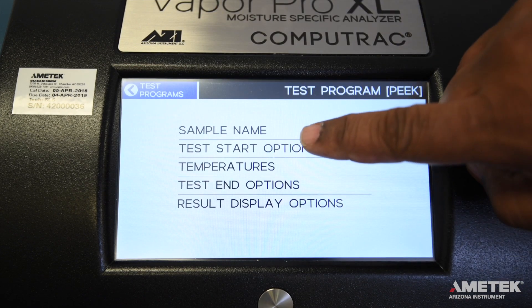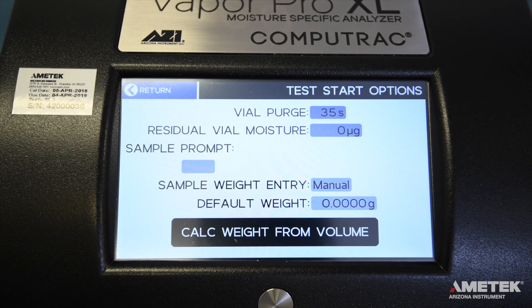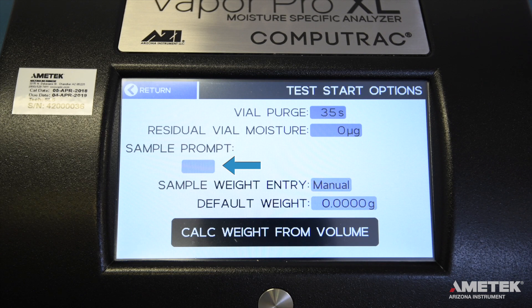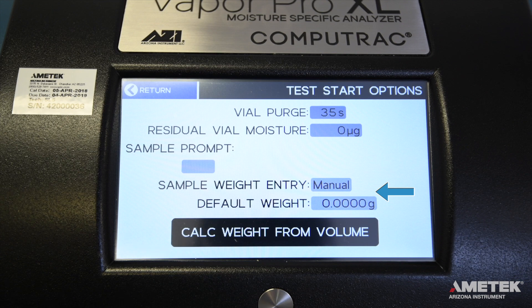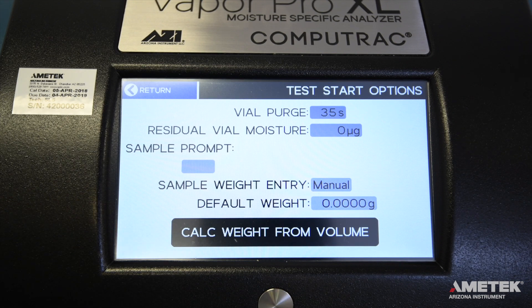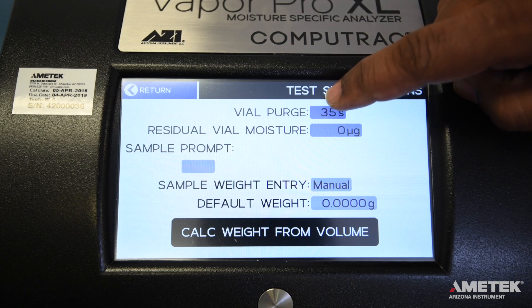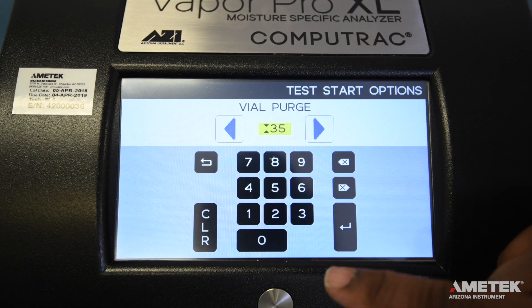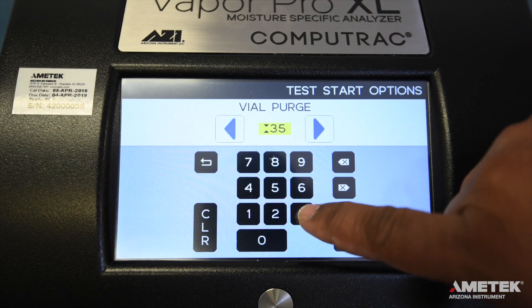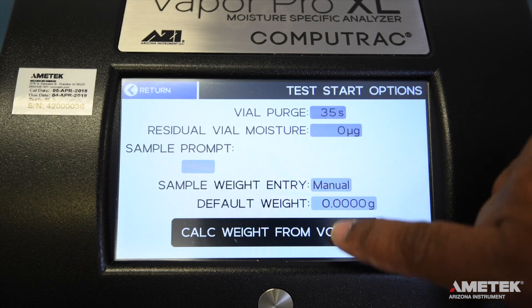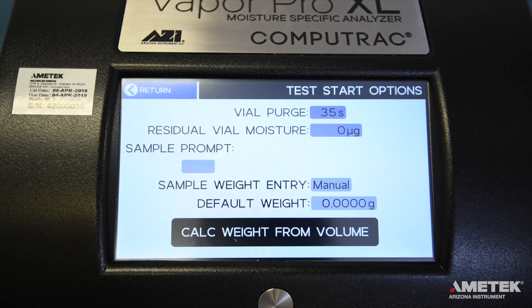Next up are the Test Start Options. This includes Vial Purge Time, Residual Vial Moisture, Sample Prompt, and — if you have selected either PPM or Percent Water for your results — Sample Weight Entry and Default Weight. Select each field you would like to edit, enter the information, and press Enter to save. Leave Residual Vial Moisture as is unless otherwise instructed.